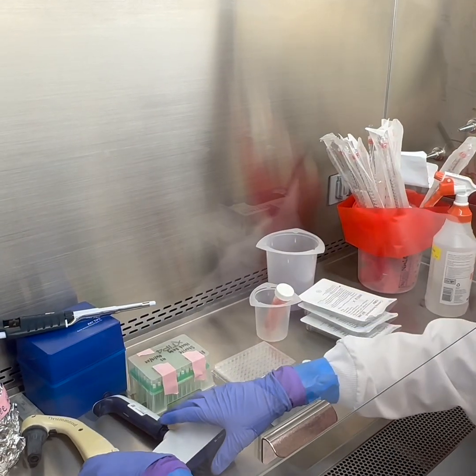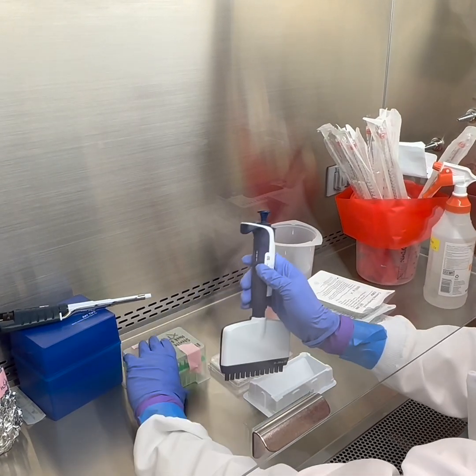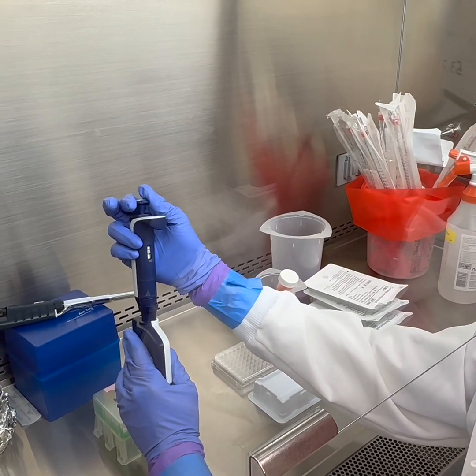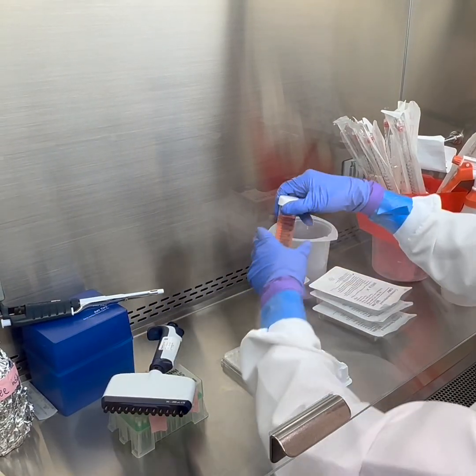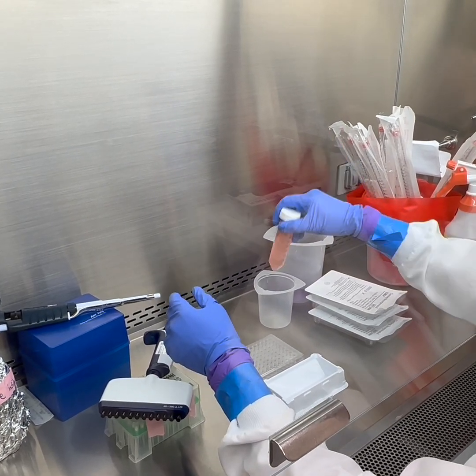So I'll just organize my stuff. It's getting full. All right. So this is set to 100. We're using sterile tips. I'm going to make sure this is mixed up really well.